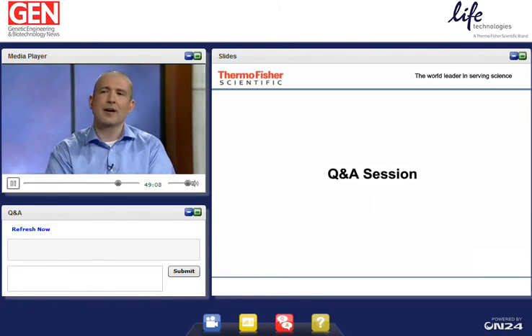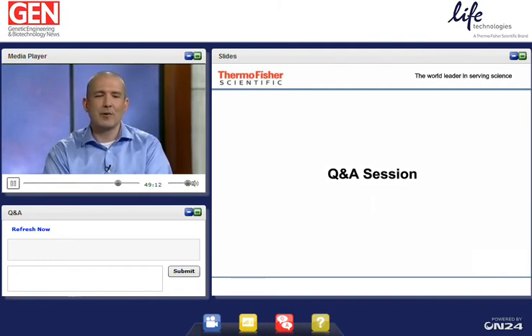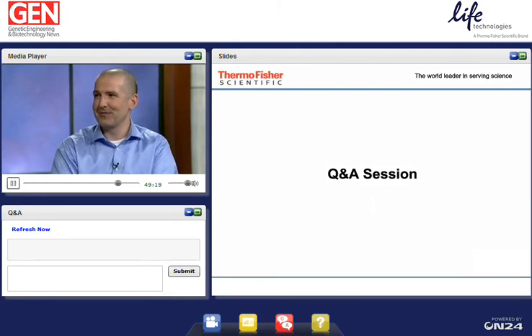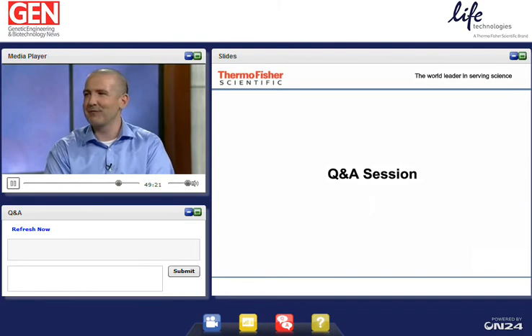and then load it up. Like Thomas, you said, it's a 10-minute setup. I know we've had races in the lab, like how quickly somebody can set up an iBind. We've been able to push the envelope even more, and we laugh about that, but we can set them up very quickly. So yeah, there is no blocking step per se.